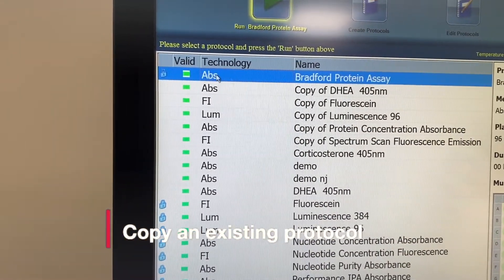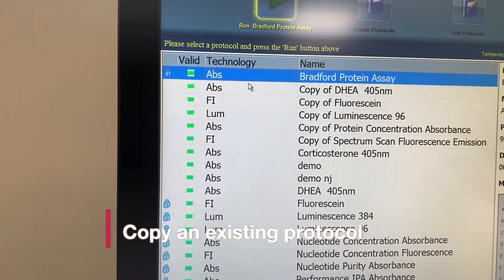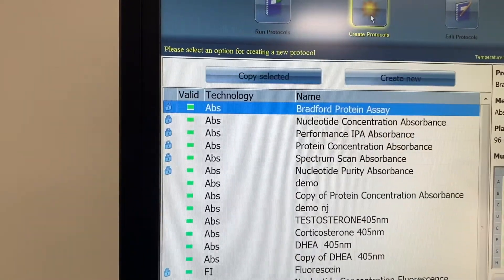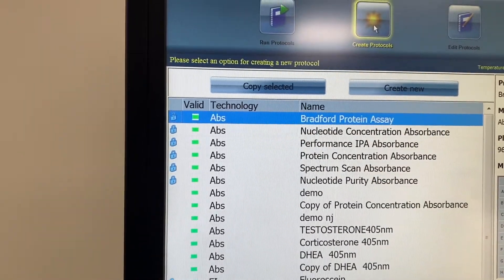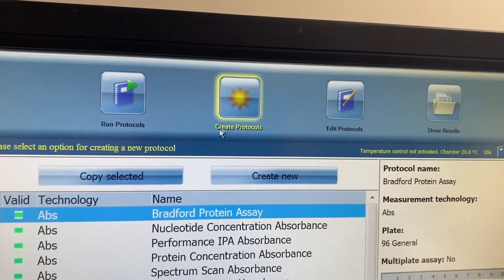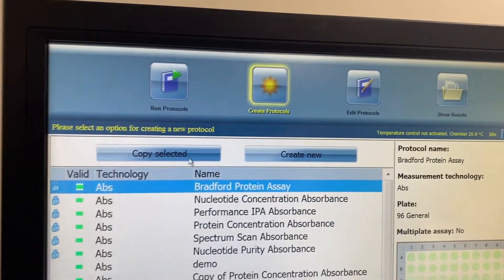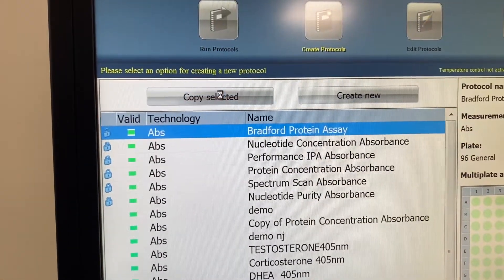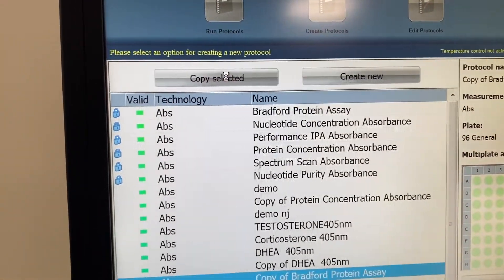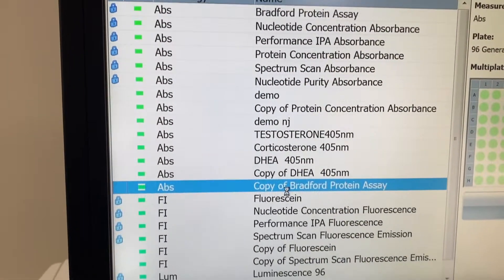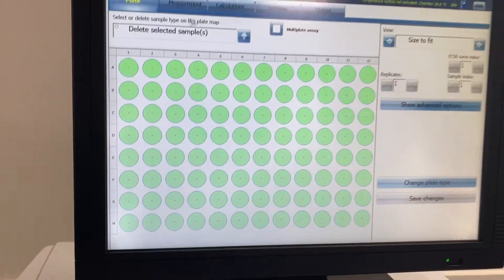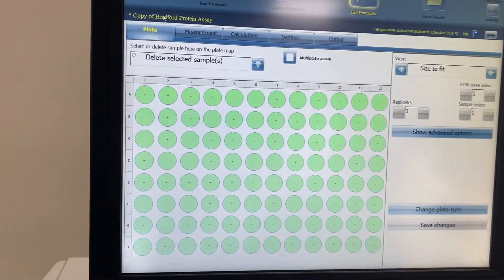Say you are doing an absorbance-based plate read. What you can do is copy one of the existing protocols that they've given you. To do that, you just highlight it, then go to 'Create Protocols.' In Create Protocols you can see there's a 'Copy Selected' option, so you can copy it and you'll see it's appeared here as a copy.